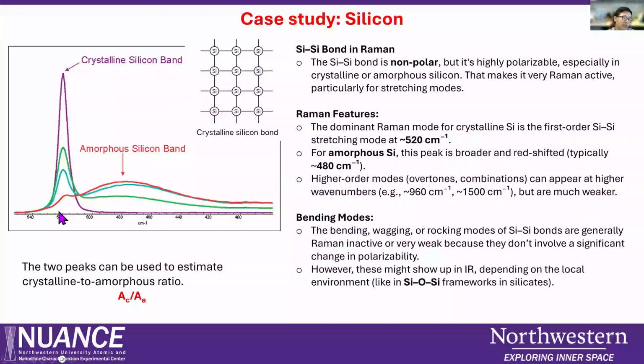Based on this, with deconvolution of these peaks, we can get the ratio of crystalline and amorphous material.